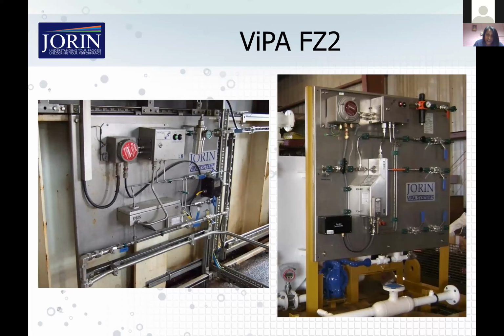Then we have fixed skids. So these are our permanent installations. So they tend to get connected on site, right next to or as close to your sample point as possible. And these are hazardous area rated zone 1.